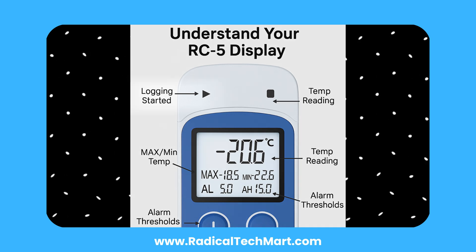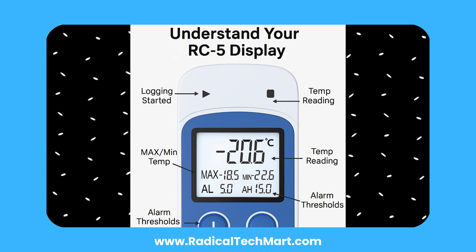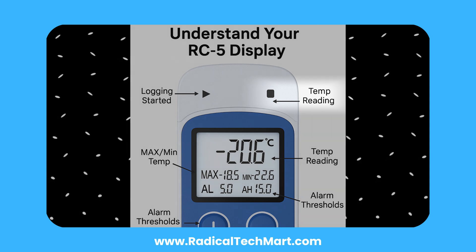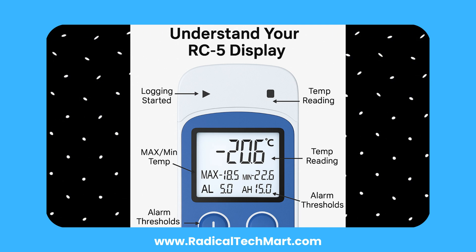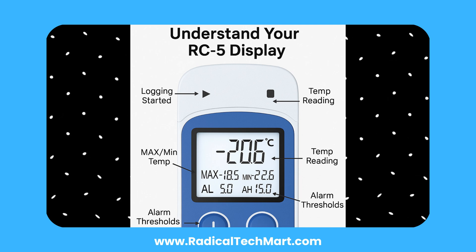To begin recording, press and hold the button for 5 seconds until the triangle icon appears. The device starts logging after the delay if one is set. To stop recording, press and hold again until you see the square symbol. Press the button once to scroll through current temperature, reading count, time, date, max and min temperatures, and your preset alarm thresholds.